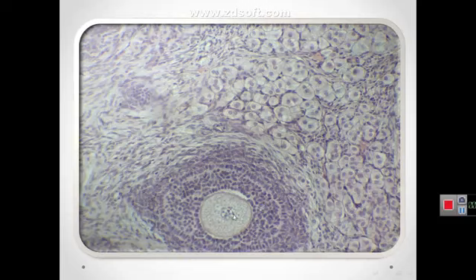The multilaminar primary follicle consists of an oocyte with nucleus, zona pellucida, granulosa cells forming stratified epithelia, and the surrounding stroma.